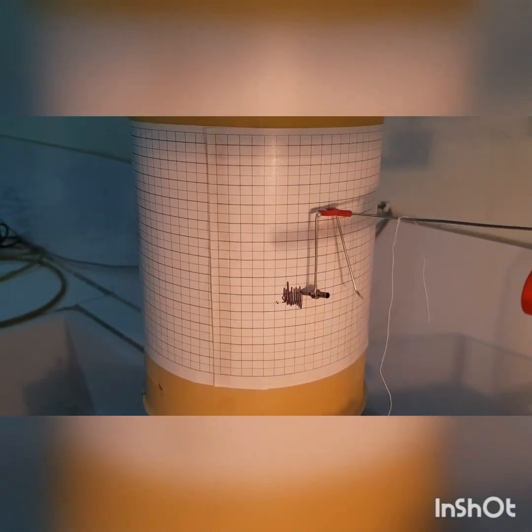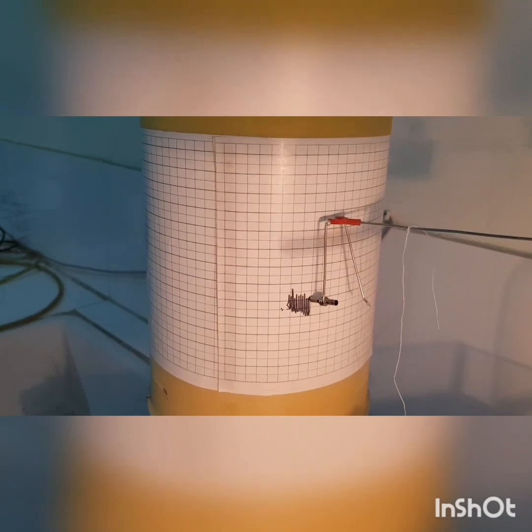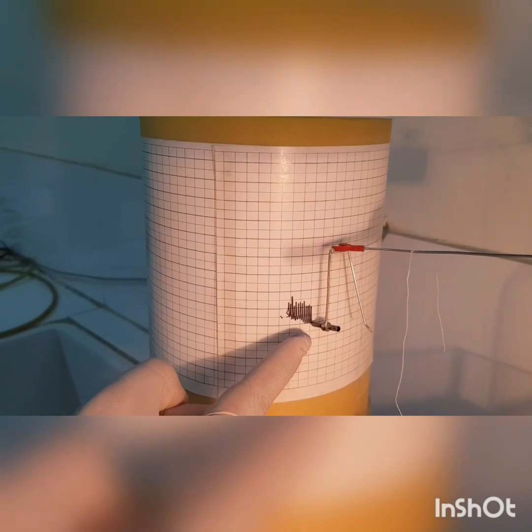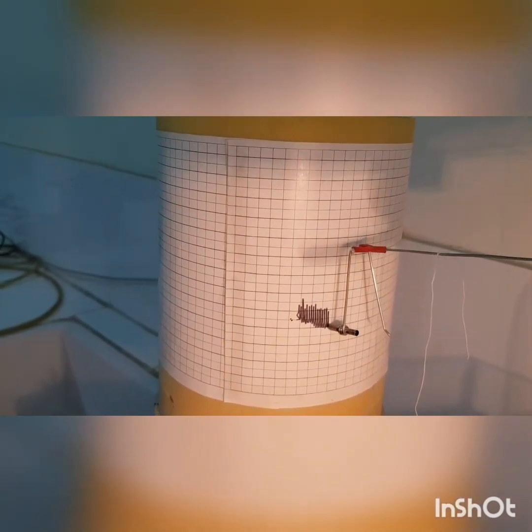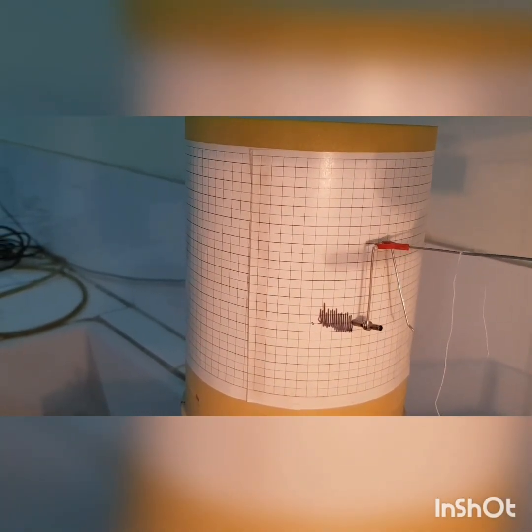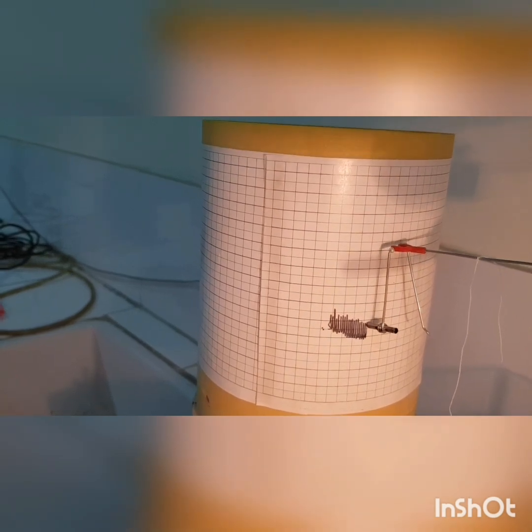Bismillahirrahmanirrahim. To study the surmountable antagonism between acetylcholine and atropine, this is the normal contraction, and after normal contraction, first we will give the agonist. The agonist will stimulate the muscarinic receptor and it will produce approximately 50% of response.